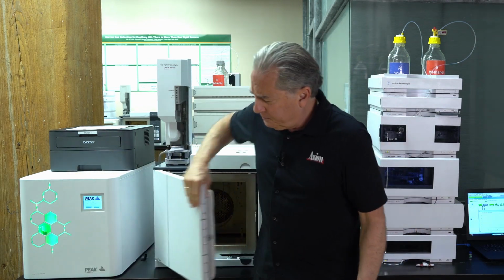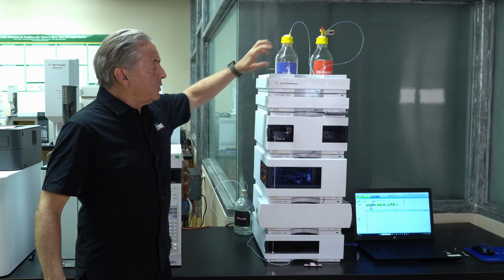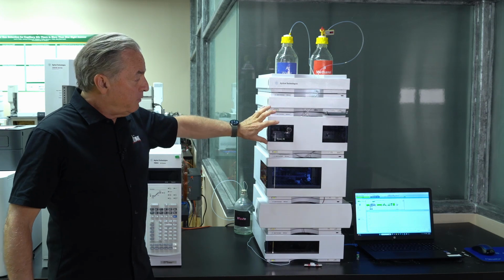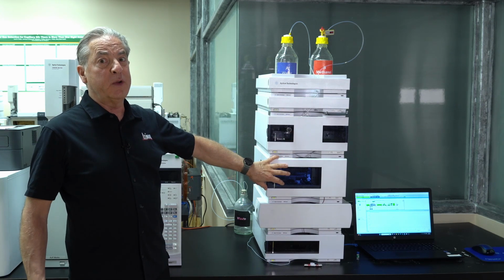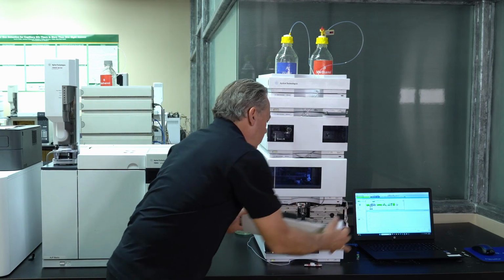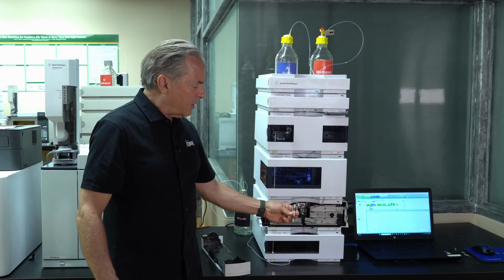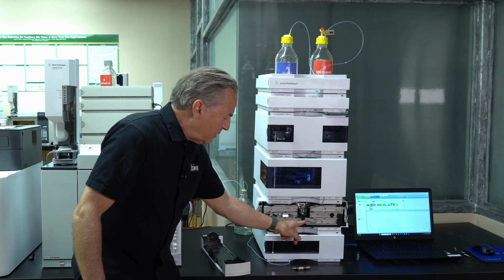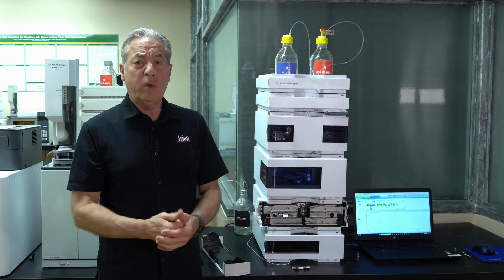Now the HPLC, we're going to have similar components. We start with the solvent bottles, we go through a degasser, we then move on to the pump. From the pump, we've pressurized the solvent, and we could go on to the auto sampler. That's where we're going to pick up the sample. From the auto sampler, we go to the column, and I'll pop this open. The column, in our case, is going to be a tiny little column that looks something like this. And then ultimately, coming off the column, we end up in the detector in order to see what we've separated.